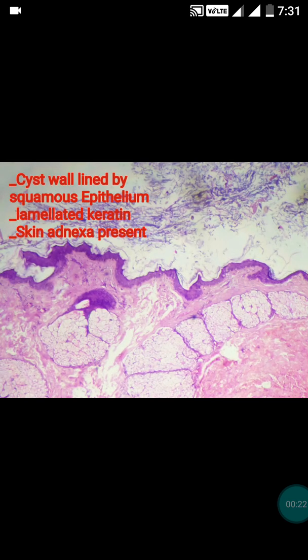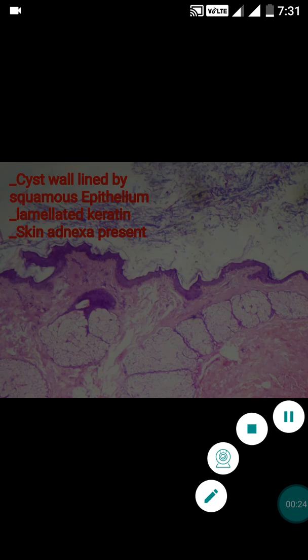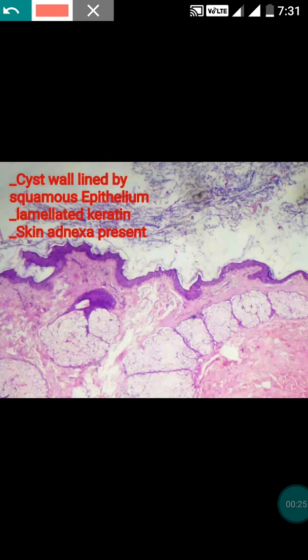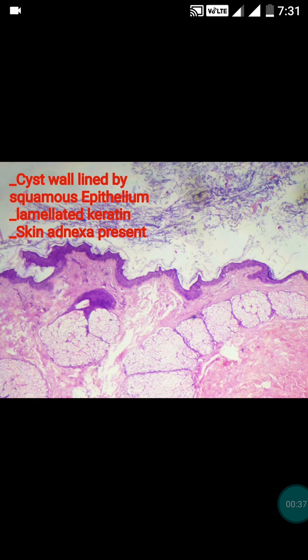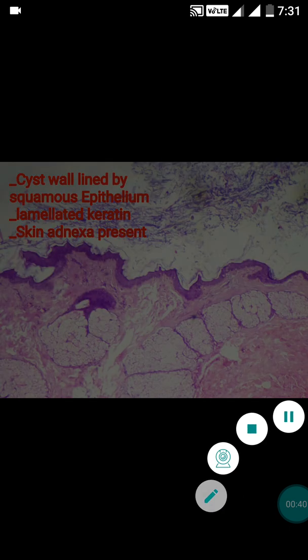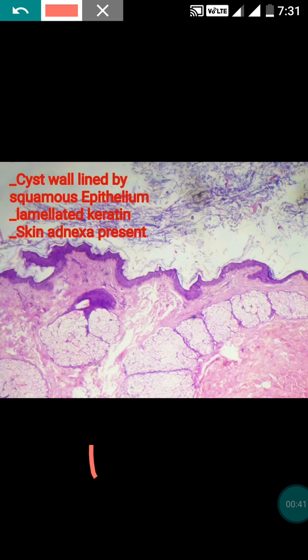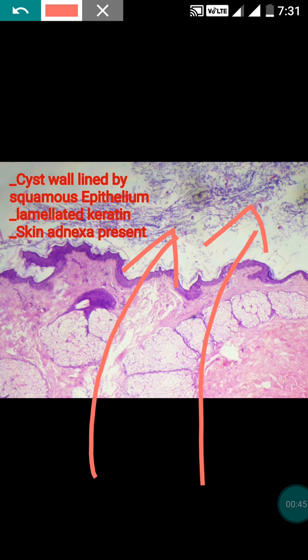In the dermoid cyst, the cyst wall is lined by stratified squamous epithelium. This is the lining epithelium — stratified squamous epithelium. Above it, there is presence of lamelated keratin. The keratin may not always be lamelated, but usually it is.